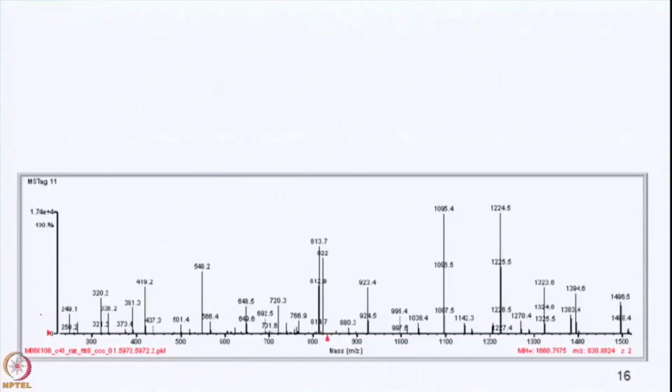What's your first impression of that spectrum? It looks a lot more complicated than the other ones, right? Part of the reason is it's a little bit longer, so the spacing's closer together.